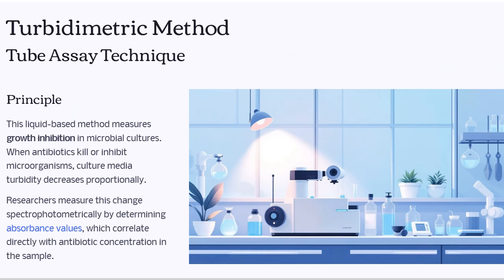Then the next method is the turbidimetric method, or tube assay method. The principle involved in the turbidimetric method depends on the inhibition of growth of a microbial cell in a liquid culture media.